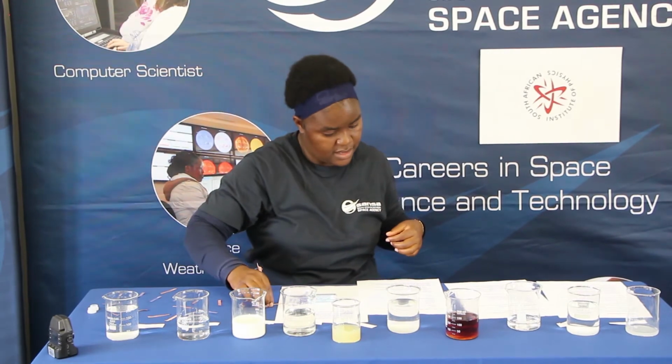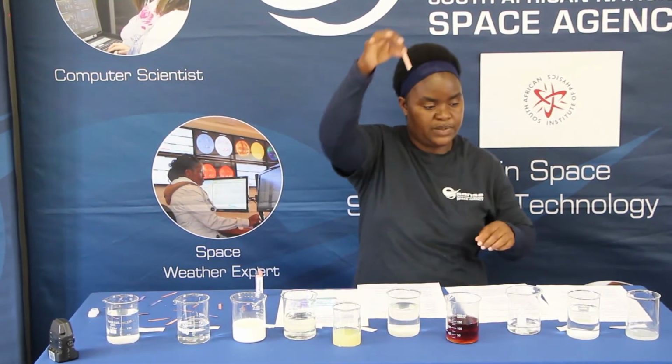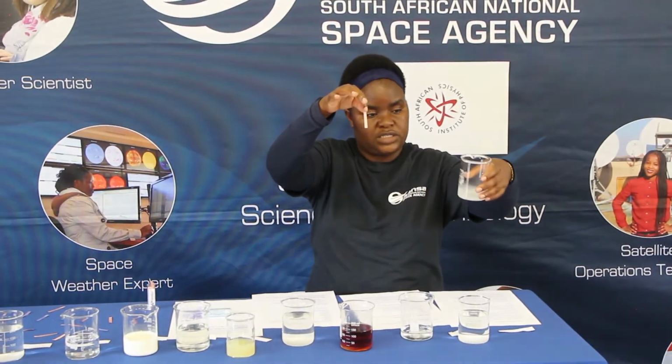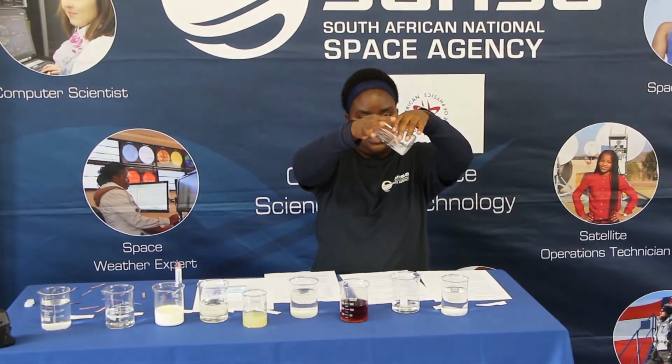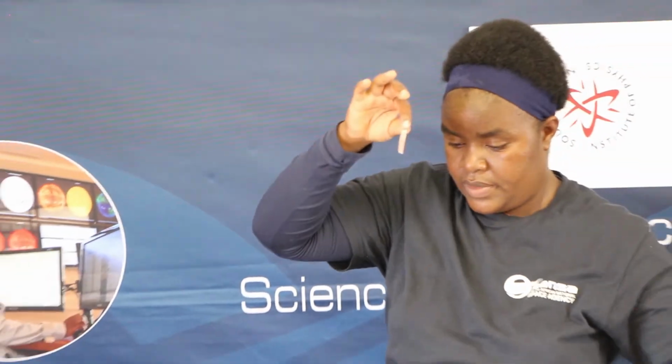And then we're going to the aspirin solution. We're dipping the red litmus paper into the aspirin solution, and let's see if there will be any changes. I hope you can see that. As you can see, that paper remained unchanged in terms of its color.